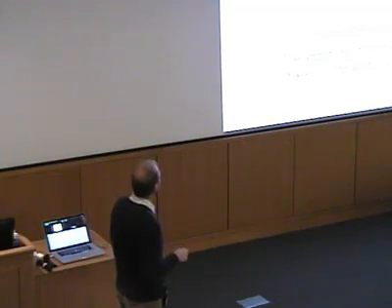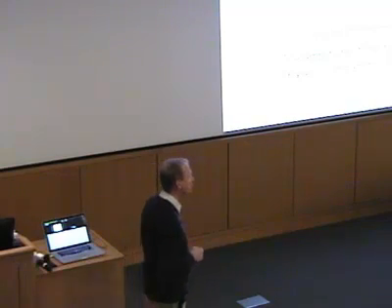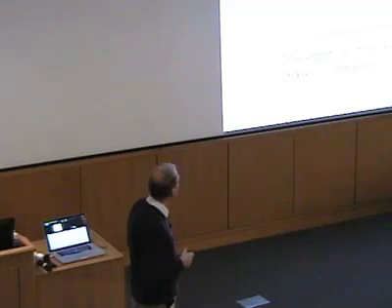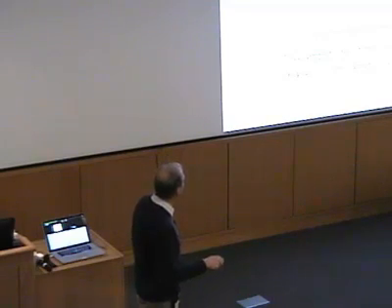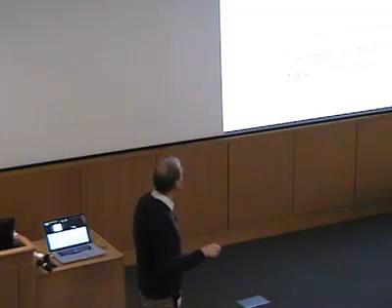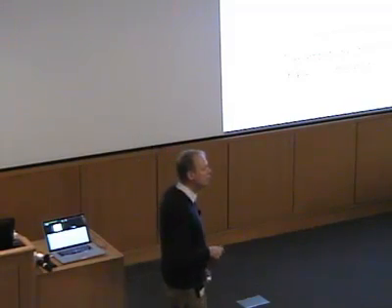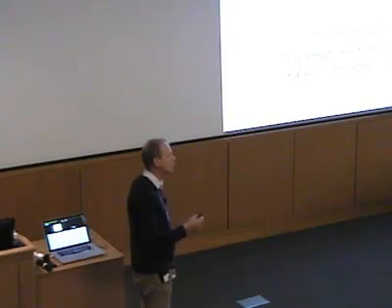So what's important here, though, is that if I know that my signal now is oscillating with this particular frequency, I can put a filter on the amplifier and only amplify components that are oscillating with this frequency. And it means that I can throw away a huge portion of the noise in my experiment and really dramatically increase the signal to noise, increase the sensitivity of the spectrometer.